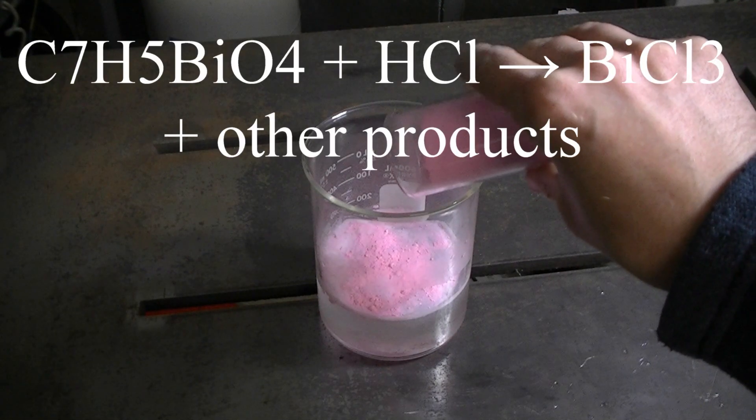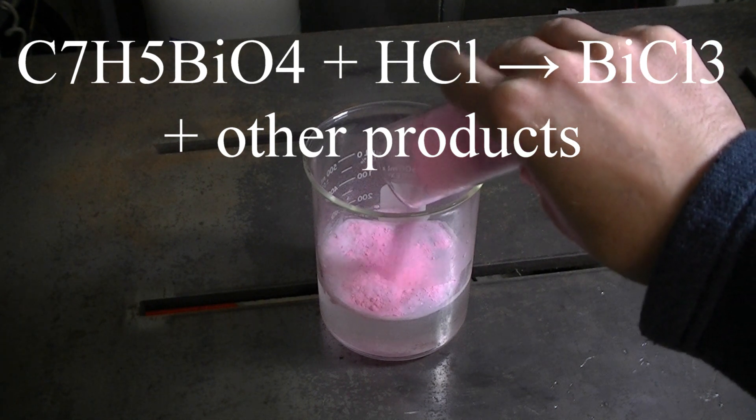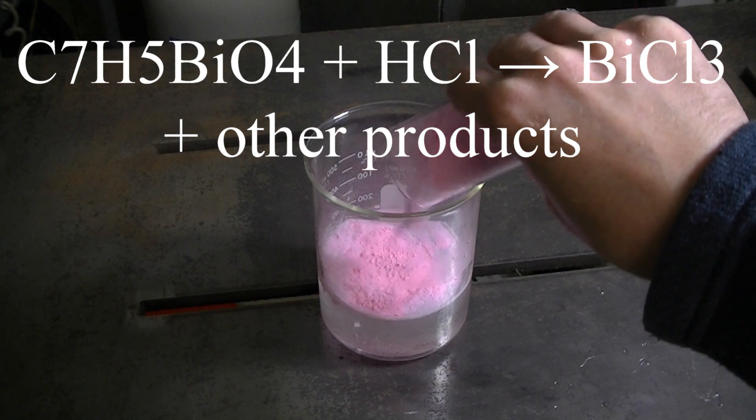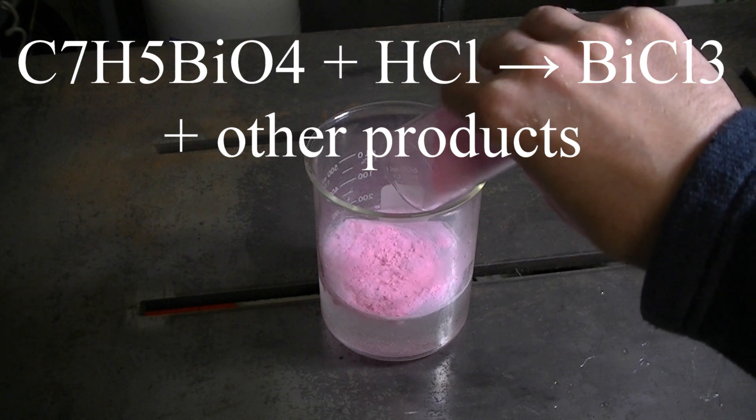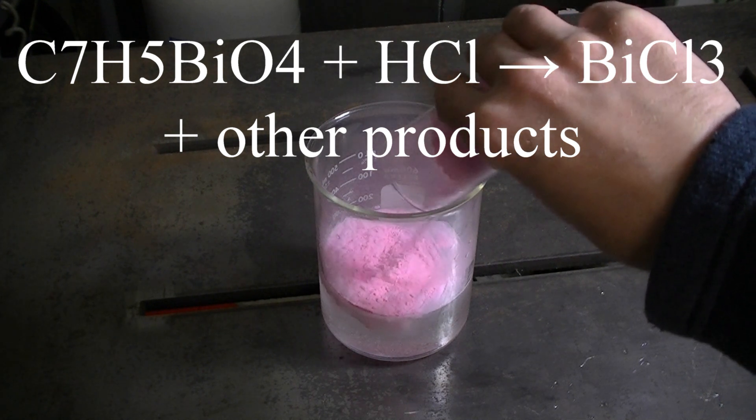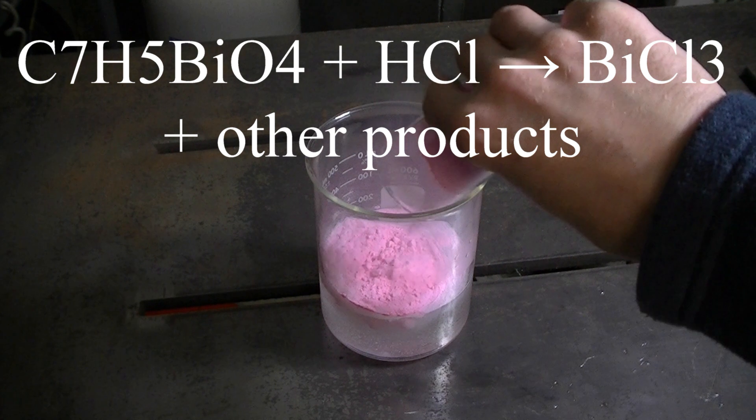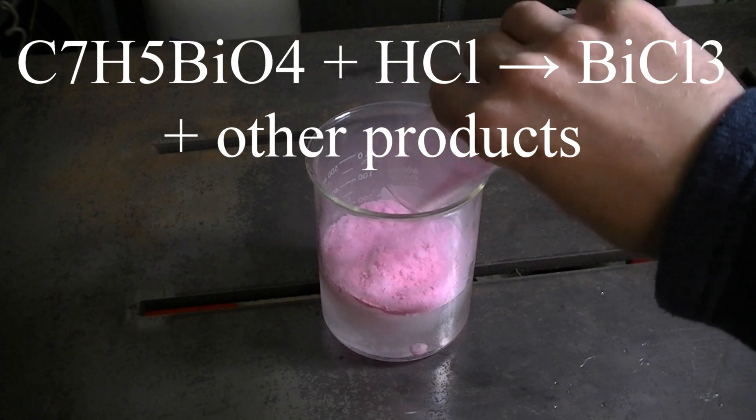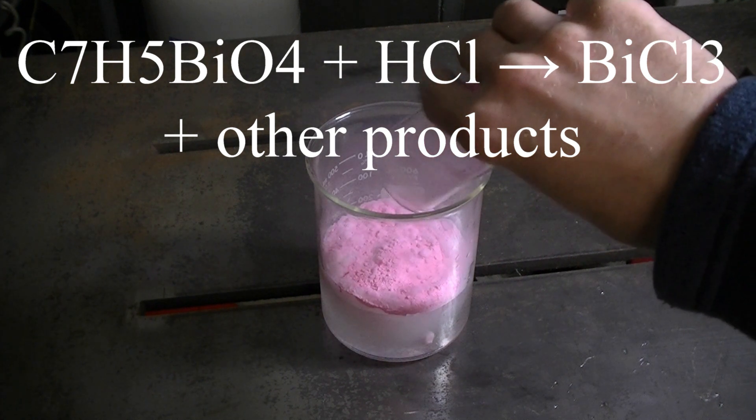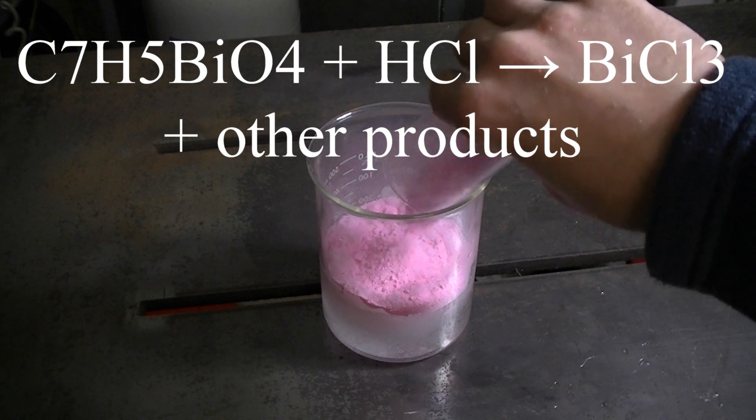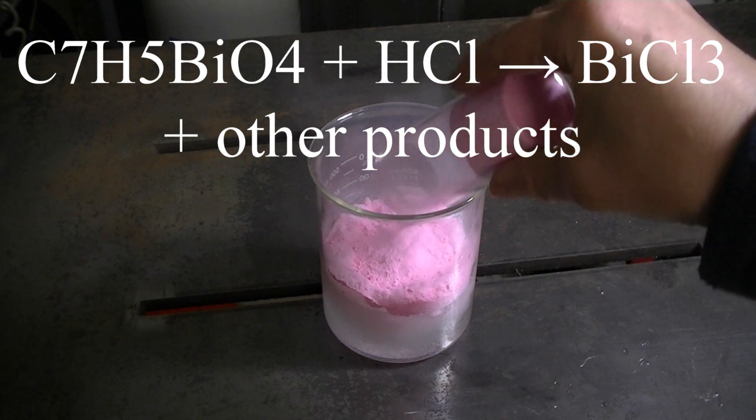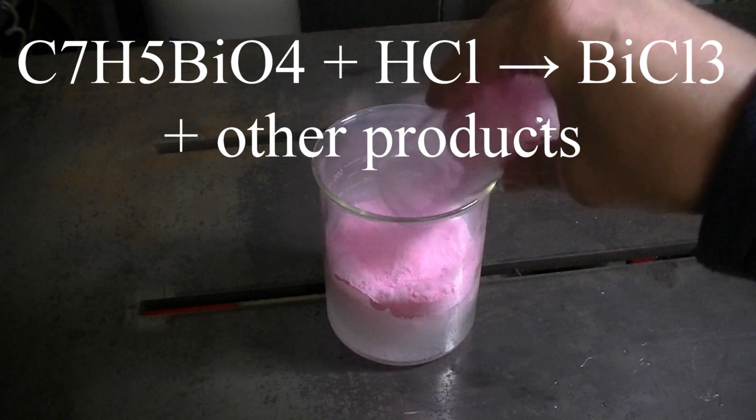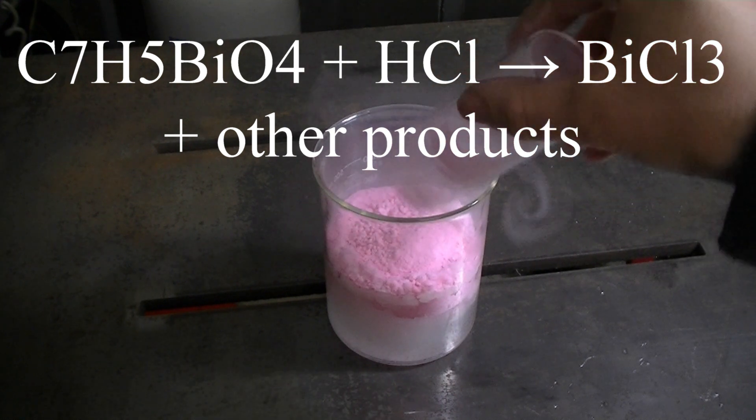The reaction that should take place, the bismuth contained within the bismuth subsalicylate, should react with the hydrochloric acid forming bismuth chloride, which is aqueous in the liquid. We're also forming some other byproducts. I can't be exactly sure what they are, but starch looks like one of them. Starch is typically added to tablets to bulk them up, because the active ingredient is typically only a very small fraction.